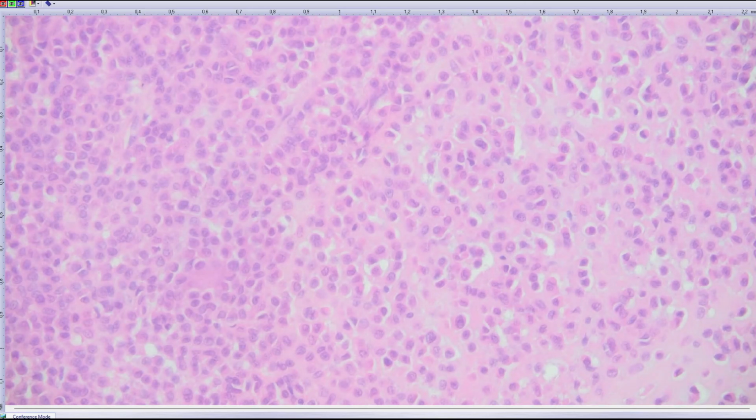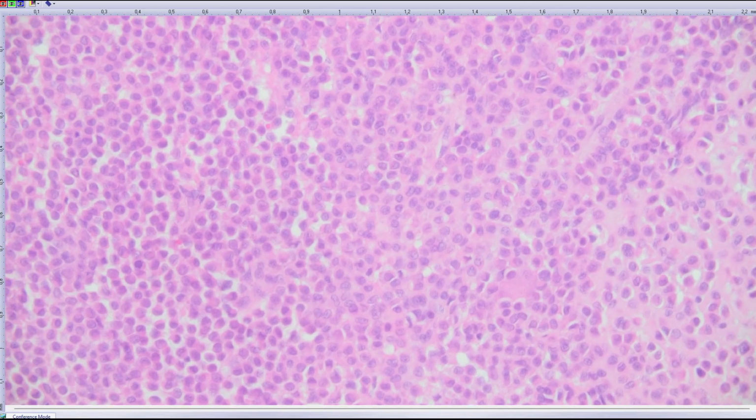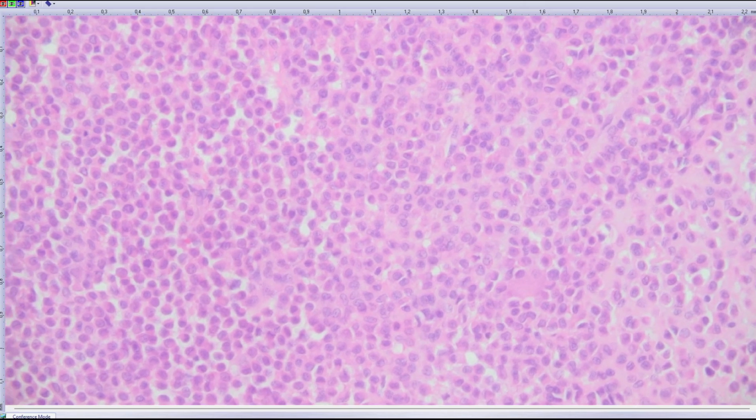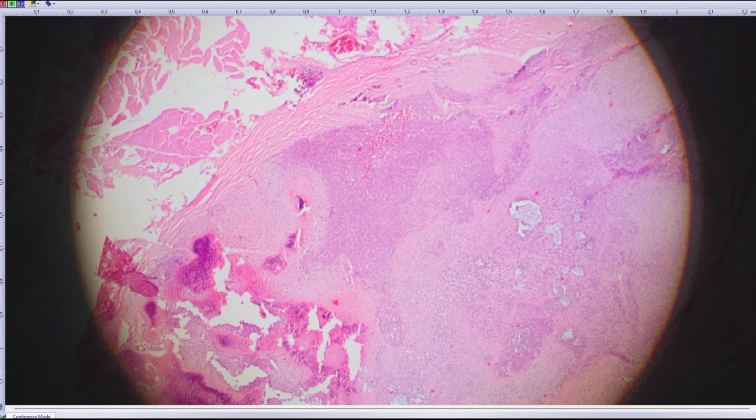Let's see. Here and there, maybe you can hear in the middle, I think. Yeah. And cleaved nuclei, immature cartilage, that maybe tells you. Sorry, where was this again? In the rib.